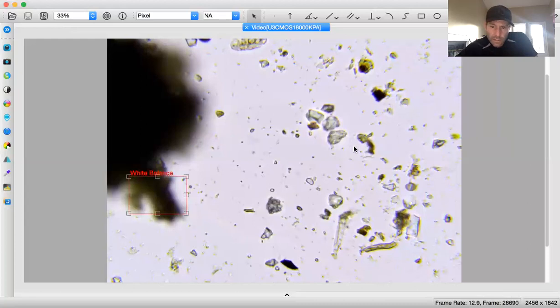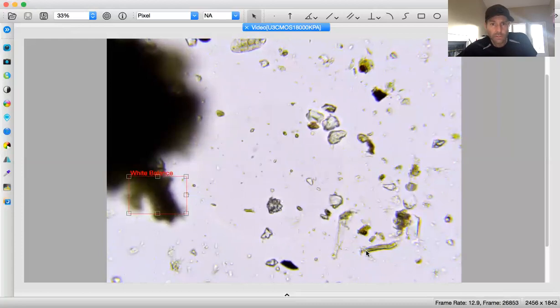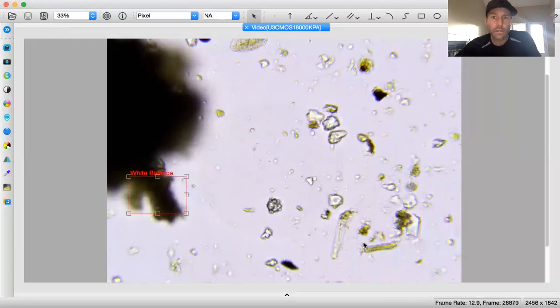This has too much texture, according to my mentor. We shouldn't record it if it has a lot of texture, because it could be a dead fungi, or it might not be fungi at all. So better to keep the assessment somewhat accurate.